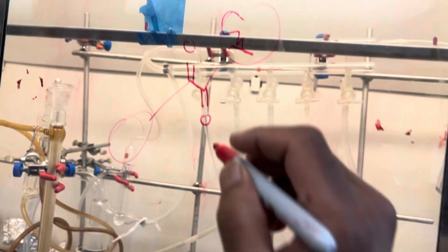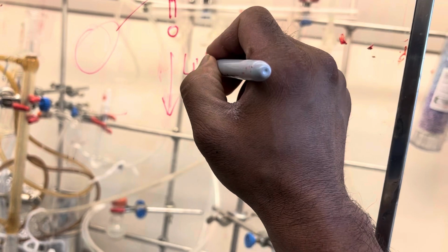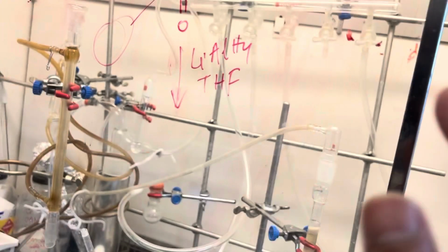Okay. So basically you did a reduction here, right? You add lithium aluminum tetrahydride in THF. So we are not concerned about changing other parts. The whole molecule will stay the same, but you will know whether this reaction happened or not, whether you have the product or not.